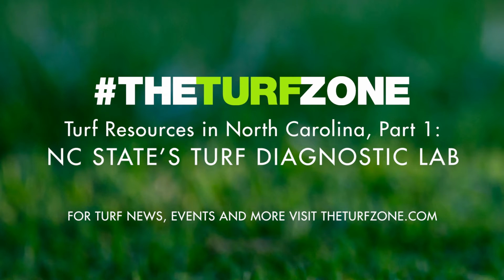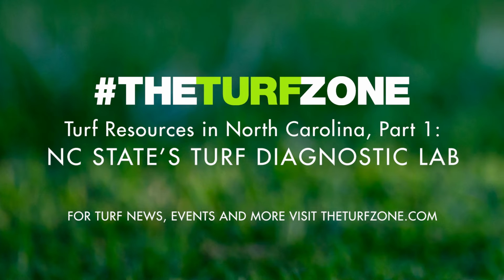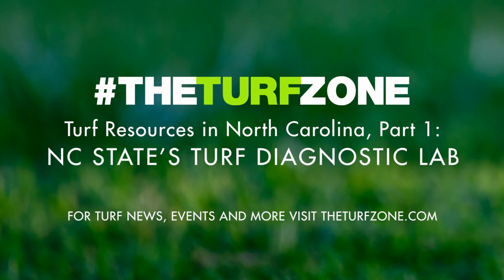We require photos with all submissions, and you can upload those with your entry in the database. You can also upload files such as spray records, soil test reports, nematode reports, etc. We will not process your samples until we have photos. This allows us to understand exactly what the symptoms are and increase our accuracy during the diagnostic process.